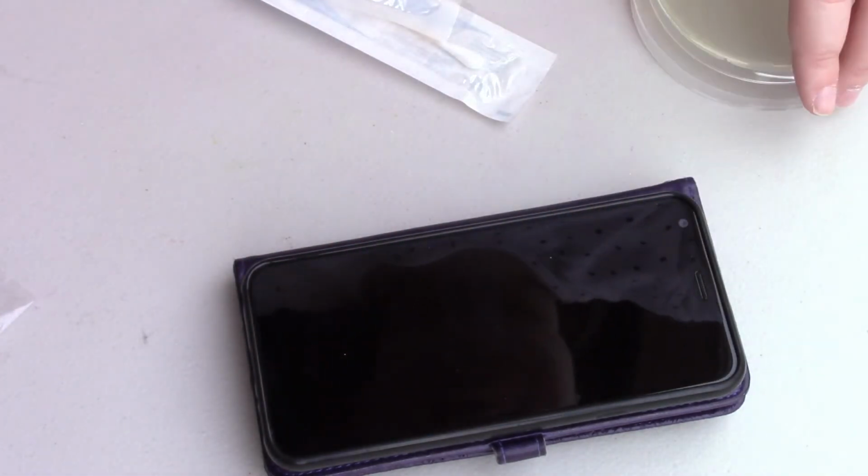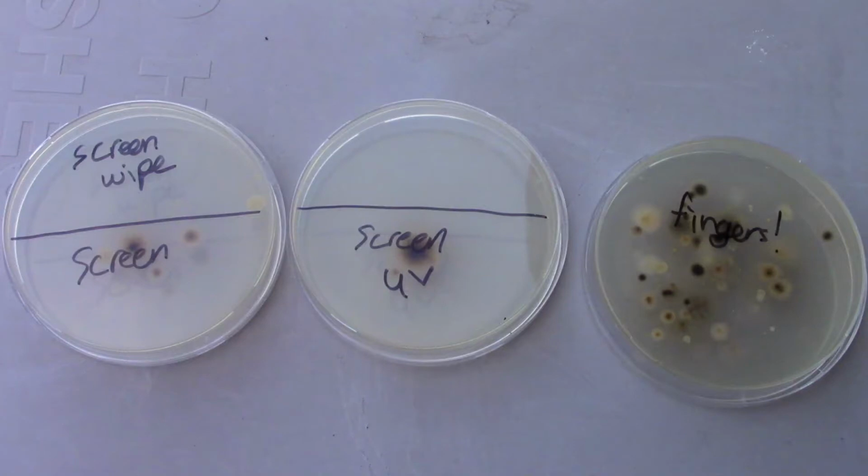All right, and who is ready for the final results? This is, I believe, about a week and a half later. I was pretty busy when I was filming this, so I might have kind of forgotten, but wowee, that whole finger Petri dish, ugh. The control that has no contaminants on it, well, it is crystal clear, right?